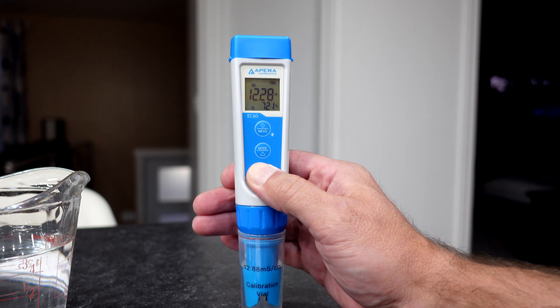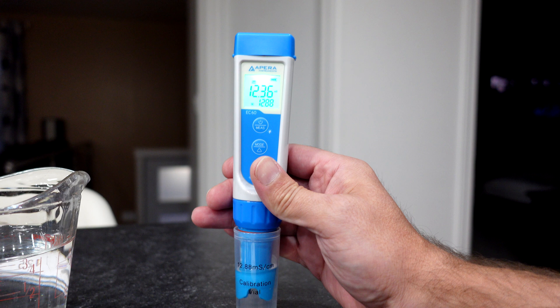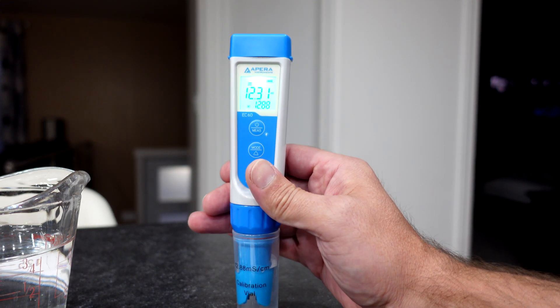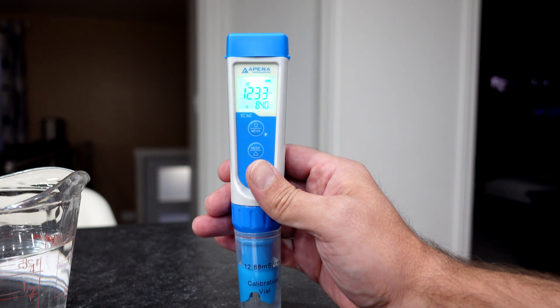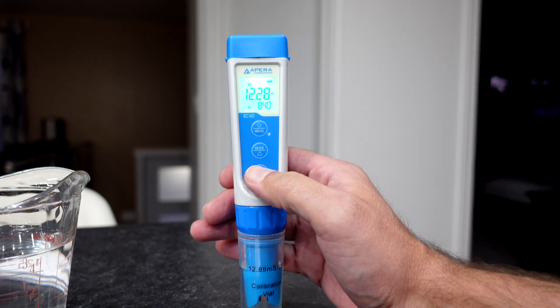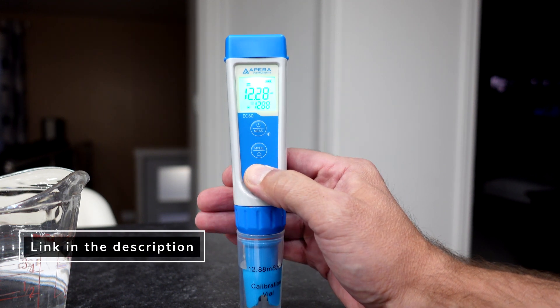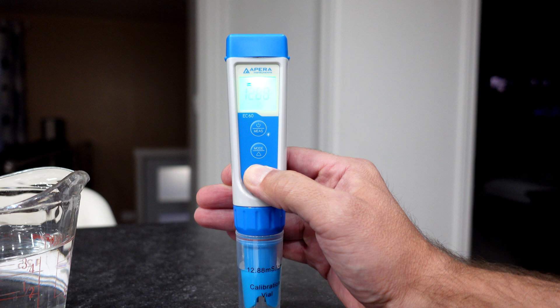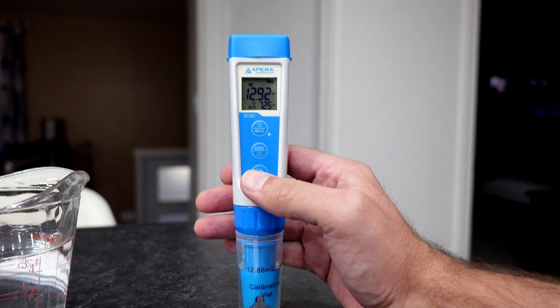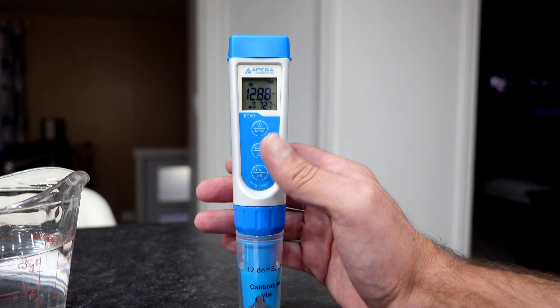And that should give us 12.88 mS. We are going to push and hold the calibration, and I'm going to swish it around in there a little bit just to make sure it's all around. I'm going to wait for our smiley face, and we're going to push calibrate. And I'm going to get a 12.88 there.